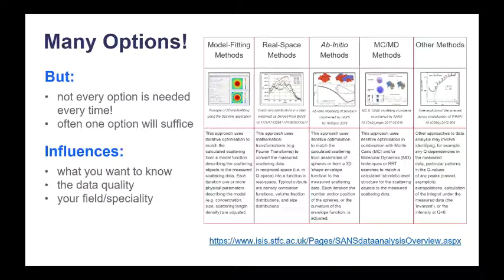At its core, SasView is one of these model fitting programs, and that's where I'm going to spend the majority of the remainder of my time today demonstrating. However, it does perform some other types of data analysis. But by design, SasView does not perform ab initio or Monte Carlo or molecular dynamics modeling.